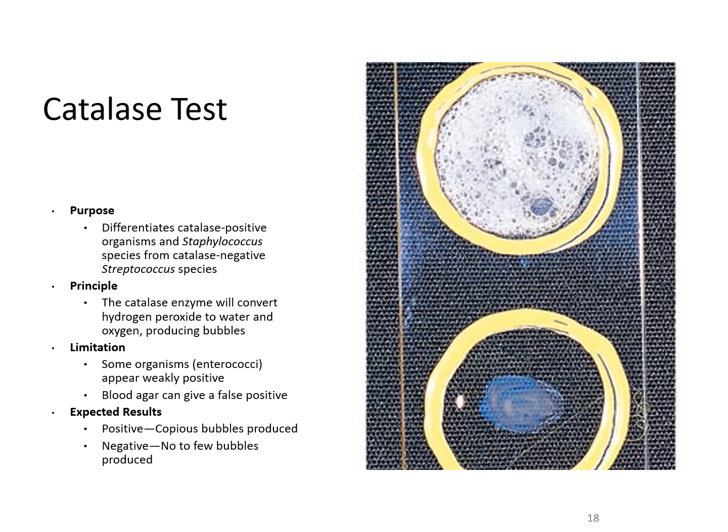If you've ever gotten blood on an article of clothing and added a drop of peroxide to it, or even on a wound, you'll see a lot of bubbles created. So you want to avoid accidentally getting any of that blood agar from the plate, because it could give you a false result.